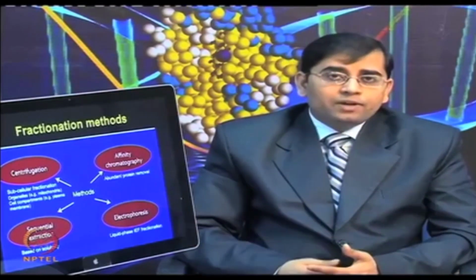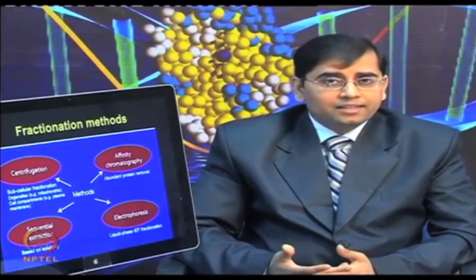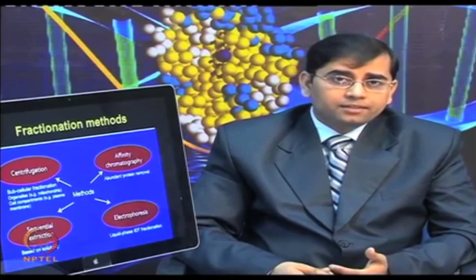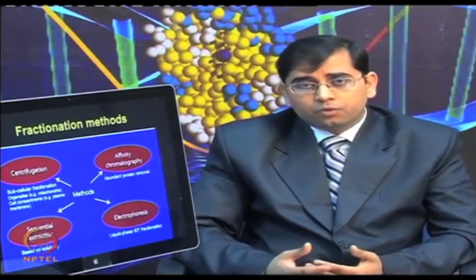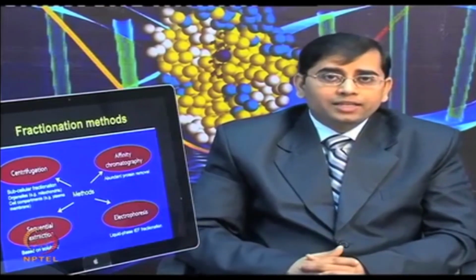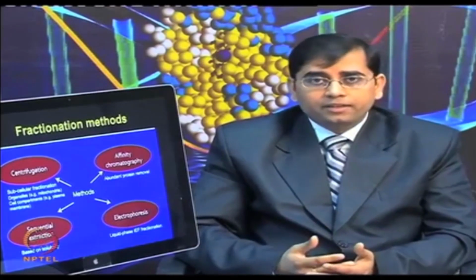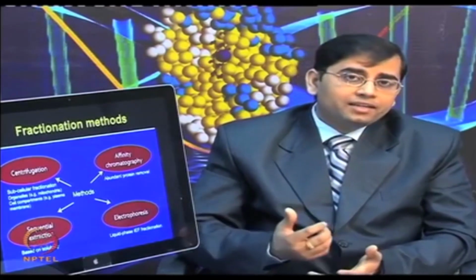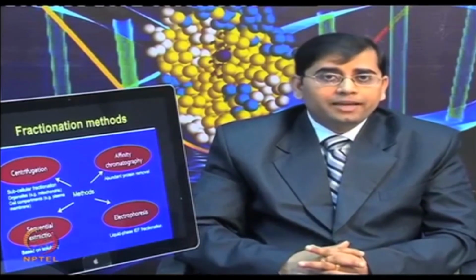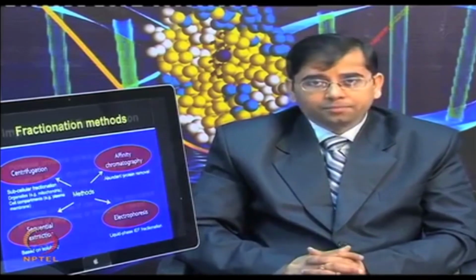In the next lectures, when I talk about specific gel-based and gel-free techniques, I will describe a new method being used, off-gel fractionation, which simplifies this step of separating proteins based on their isoelectric point in the liquid phase. One can collect fractions of different isoelectric point, or pI, ranges and then further perform the proteomic analysis.